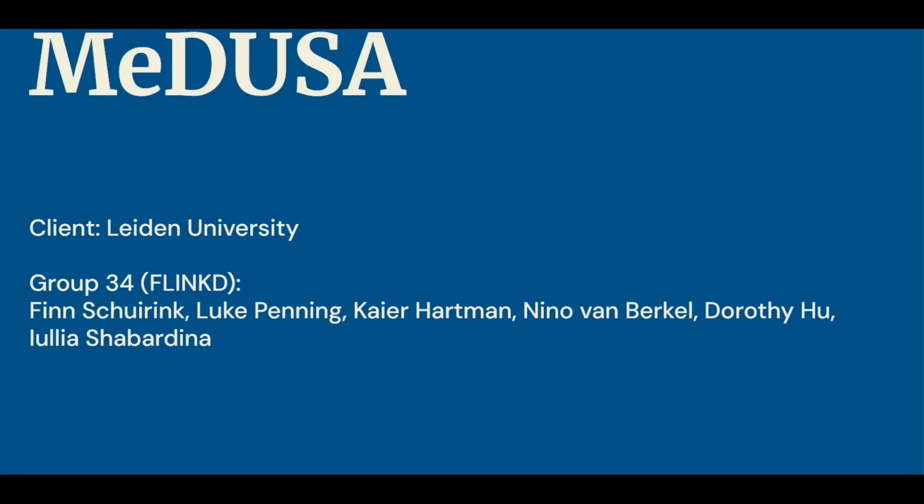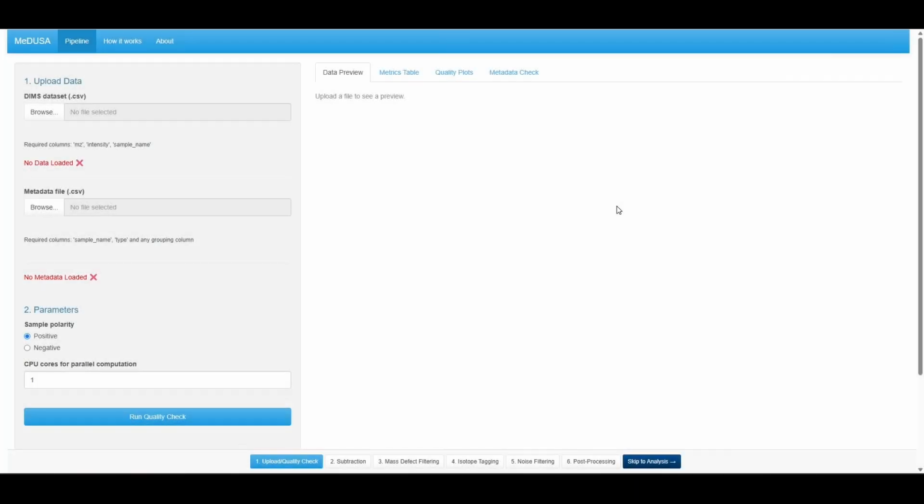I'm one of the members of Group 34, and I would like to walk you through a step-by-step tool for processing single-cell mass spectrometry data, called MeDUSA. This is the first page users see once they load the MeDUSA application.